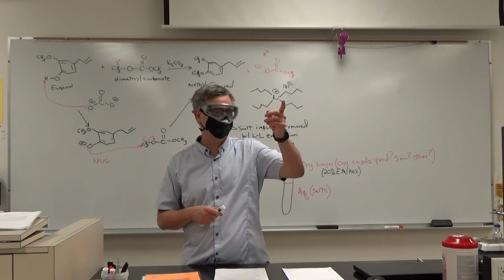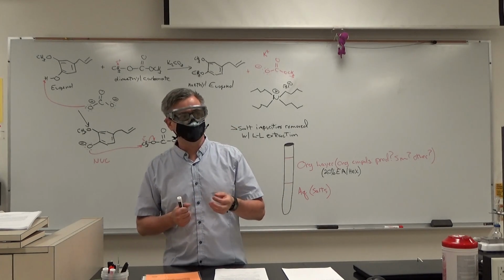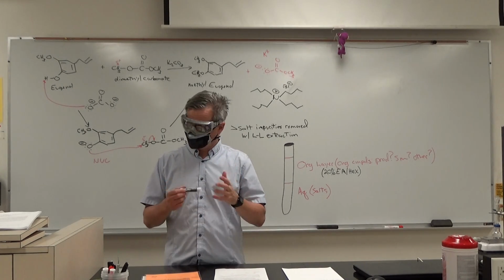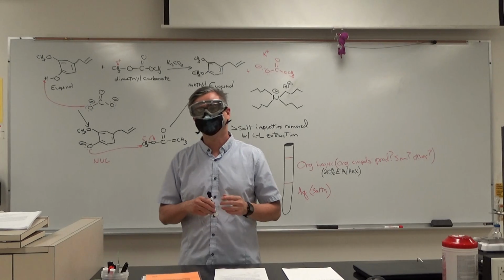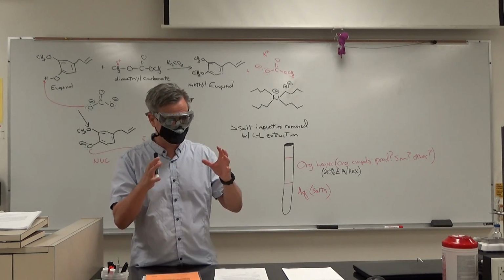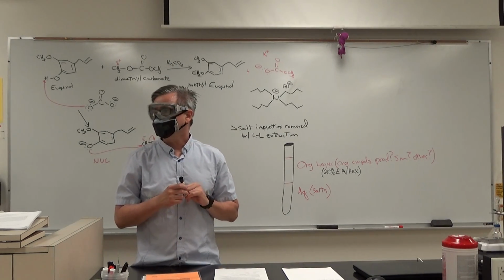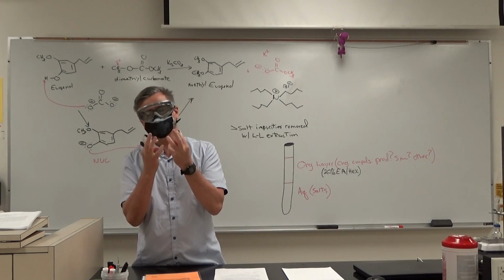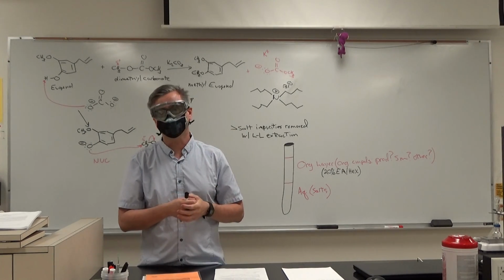I always give a visual size, like I did with the IR nerds. This is probably going to be about the size of a chickpea, and I would say maybe 2 or 3 chickpeas. But you have a visual indicator of whether you have enough magnesium sulfate in there. I call it a snow globe. You put in a couple of chickpeas of magnesium sulfate, you shake it up, and any water that's in there is going to clump up. If you've got nothing but clumps in there, you haven't added enough. If you've got some clump, but also some free-flowing powder, there wouldn't be any free-flowing powder if there was still water left in there. It would clump up with water. So the free-flowing powder is your visual indicator. Oh, I've added enough now.